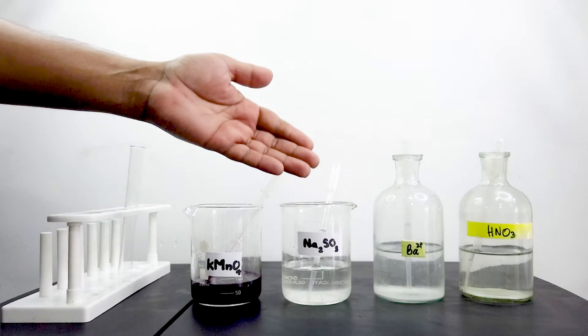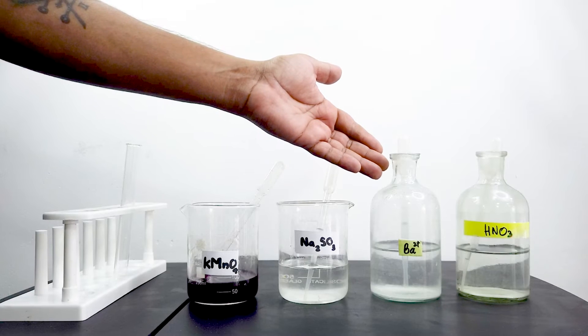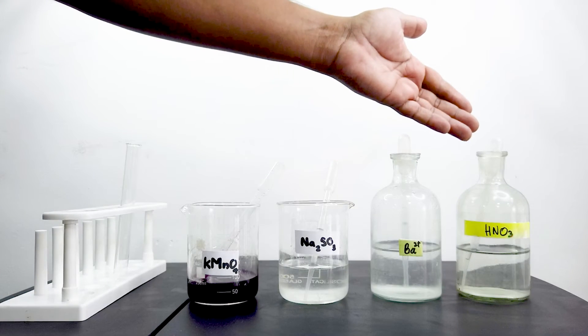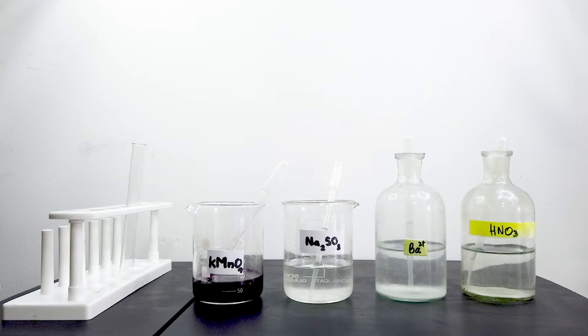Today we are going to test sulfite ions. We will use barium ion solution, nitric acid, and potassium permanganate solution.